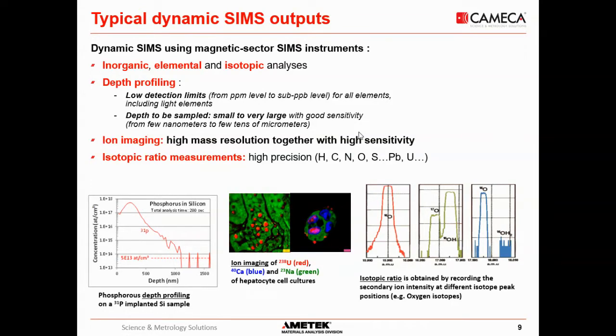The example on the left is a phosphorus depth profiling in silicon, so a lot of applications in microelectronics. In the middle, we can see an application in biology, and on the right side, we can see an application in geology, geochemistry. So a very broad range of applications.